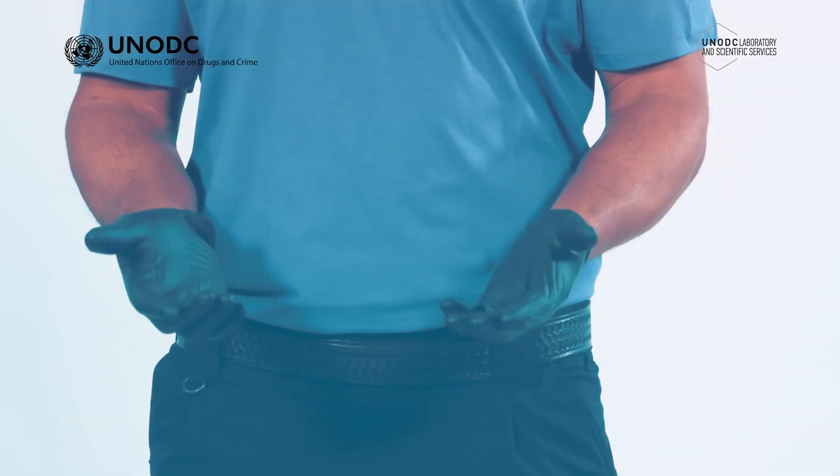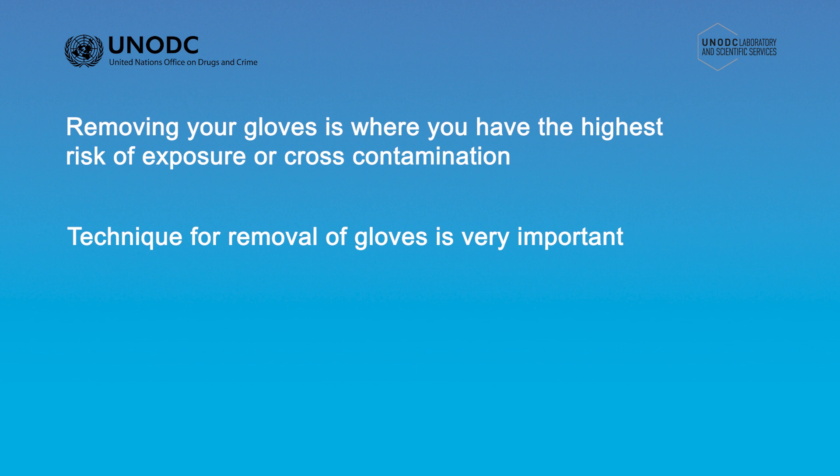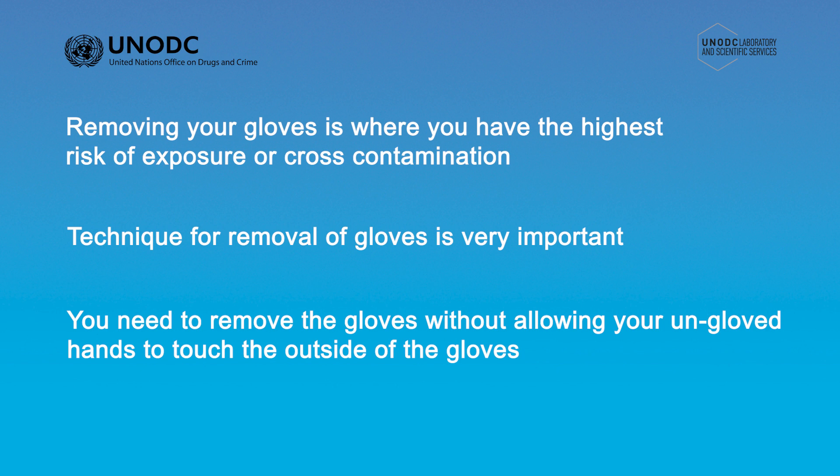Removing the gloves is where you have the highest risk of secondary exposure or cross-contamination, which is why using the correct technique to remove the gloves is so important. There are different techniques for removing nitrile gloves, but the general principle is the same. You need to remember that the outside of the gloves are potentially contaminated, so you need to remove the gloves without allowing your ungloved hands to touch the outside of the gloves.